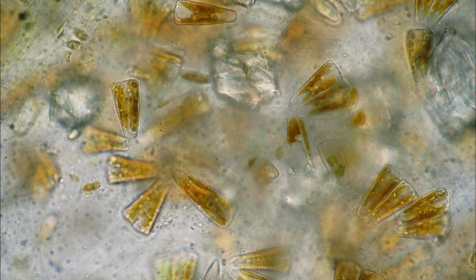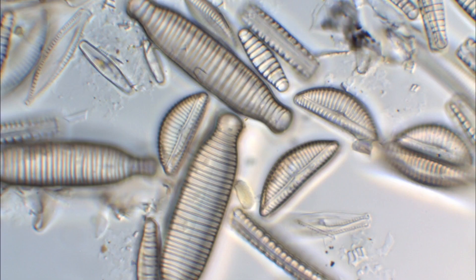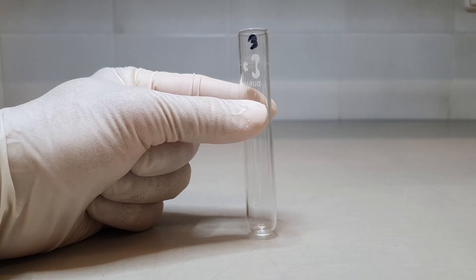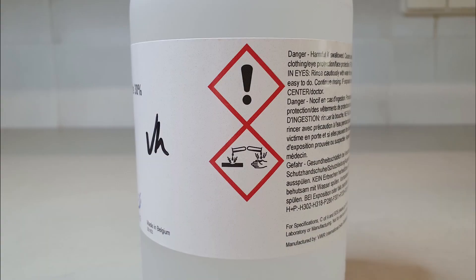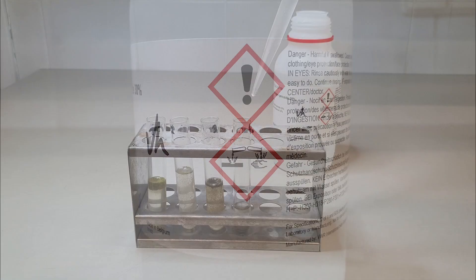For accurate identification of diatoms, it is necessary to remove all organic content from the cells. Therefore, prior to mounting, diatom samples must be cleaned by using a strong oxidizing agent.